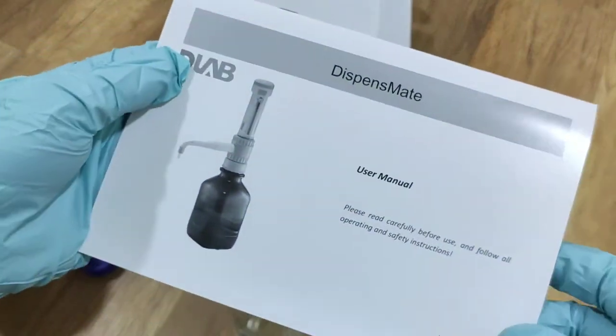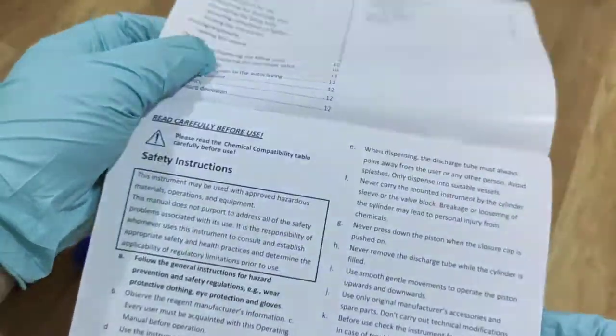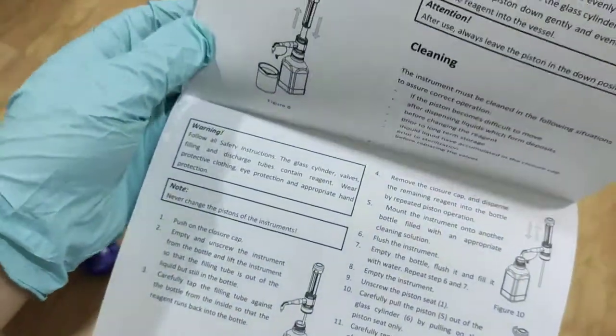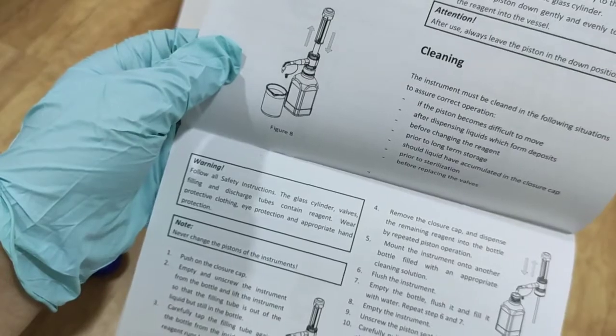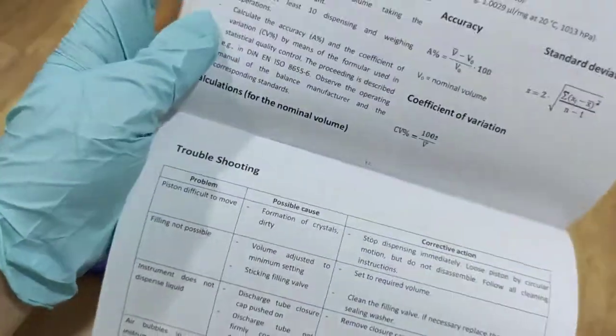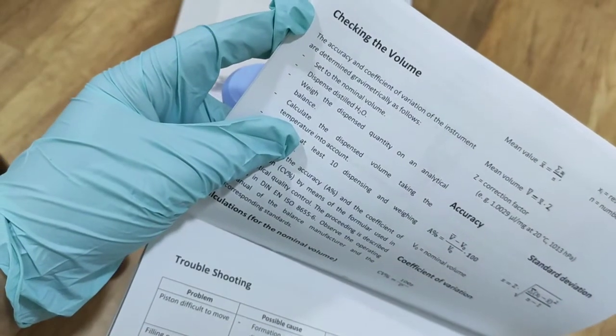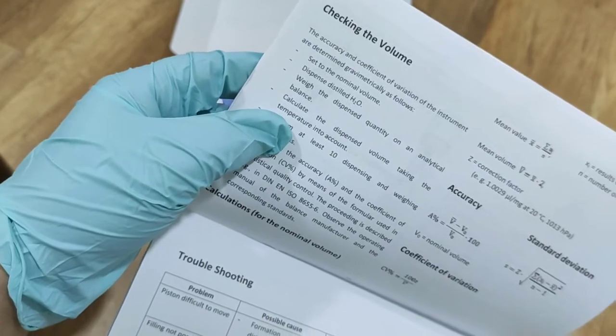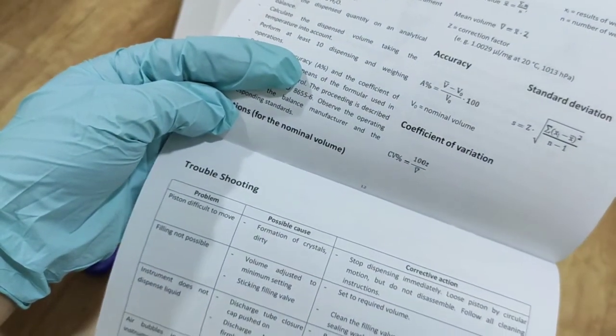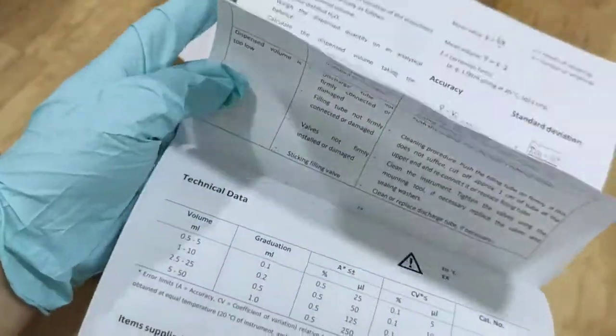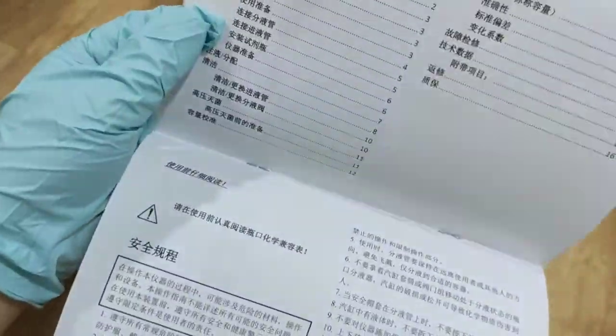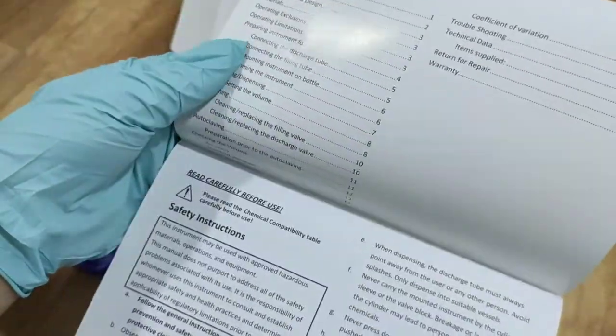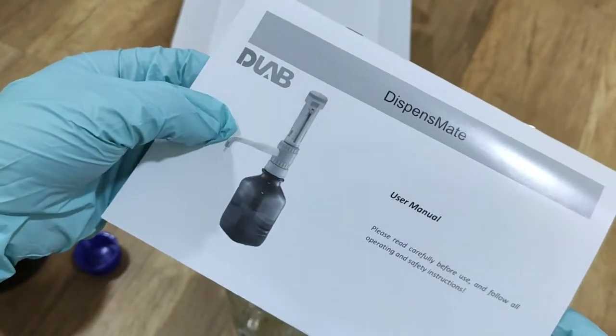And here, this is the user manual. There's many, many details we can learn from it. Just now what I showed is the basic use. There's some of the calibration, volume checking, to calculate the accuracy, standard deviation, troubleshooting, and some other technical things. All explained in this manual. So before you start to manipulate, you should read it clearly, carefully.